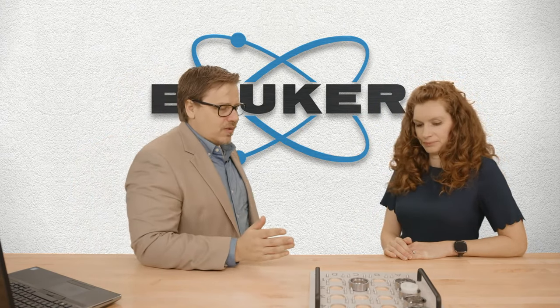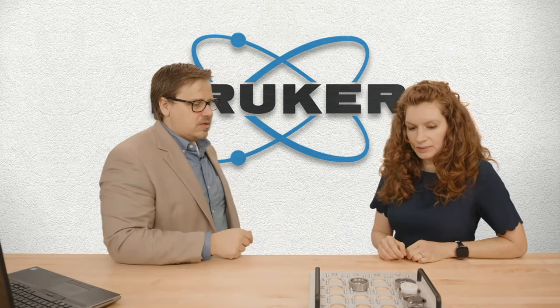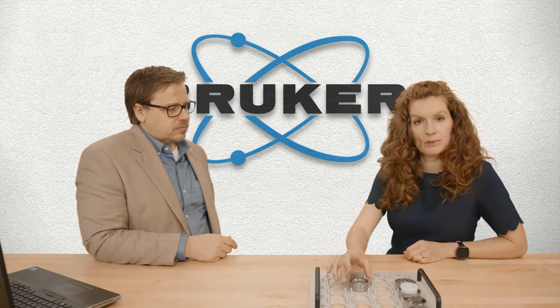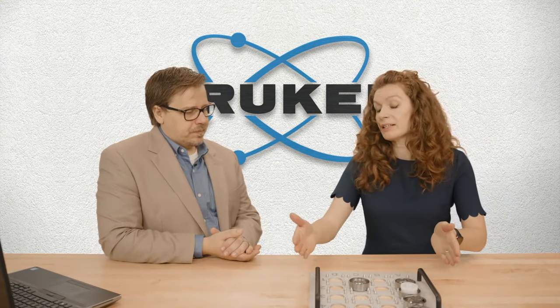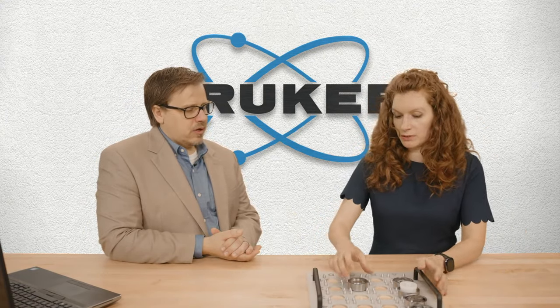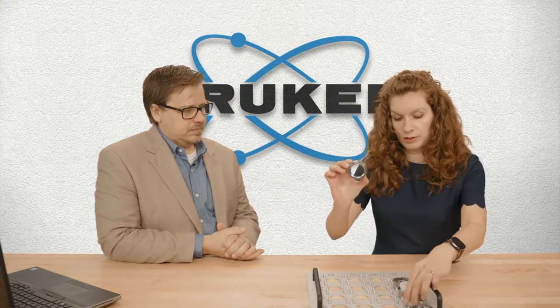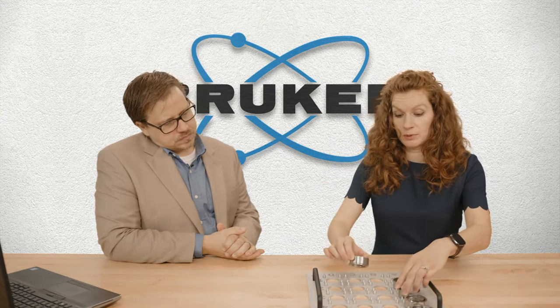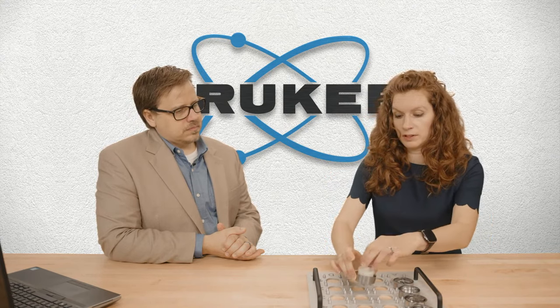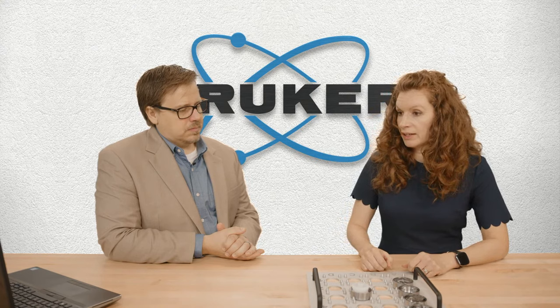So it looks like you have a bunch of different sample preps here too, right? Yes. We have some like fused bead type thing here. These are just examples of what kind of sample cups we have. This is the easy loaded tray, because it loads easily. It has different openings, so a little smaller, a little larger, very small. If you have a liquid sample or a powder, you would fill it in a cup and put it in. This cup is not fully assembled, obviously, but that's what it would look like.